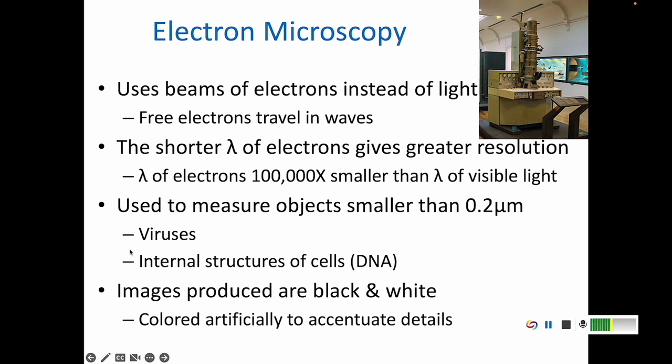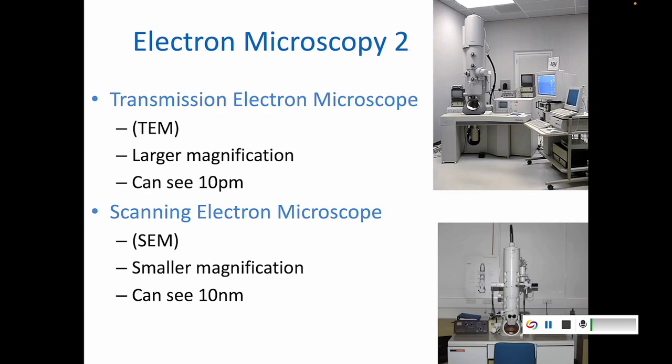In an electron microscope, the images are typically going to be black and white, and so you'll typically use a computer to artificially color them to see things. You can see how fancy this microscope is. This is no small potatoes. This is like fancy stuff. I think in our area, Ballard has some electron microscopes. There may be, I don't know. I don't know that ETSU still has one. Ballard is probably your best bet if you want to be working on an electron microscope.